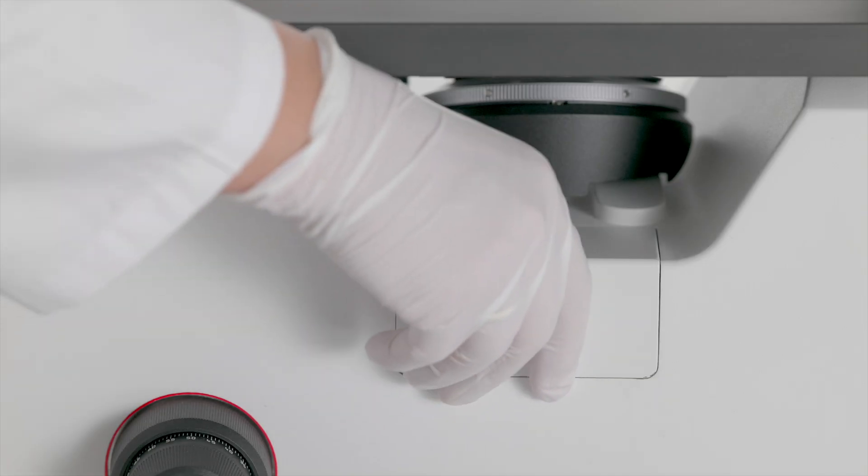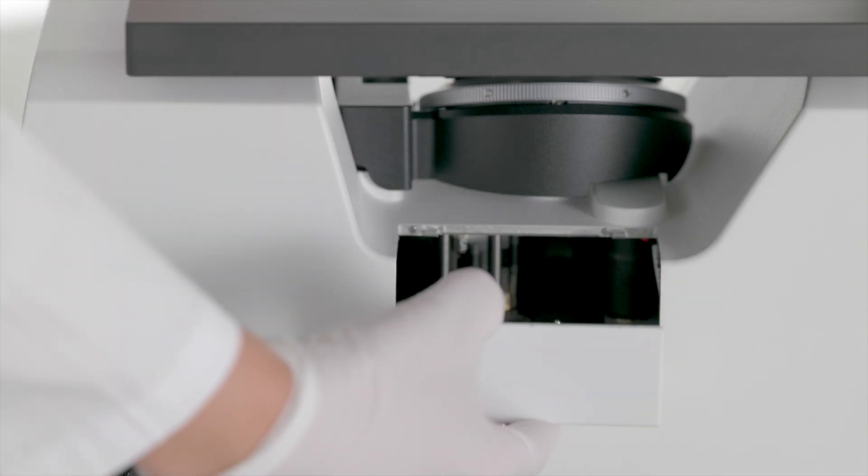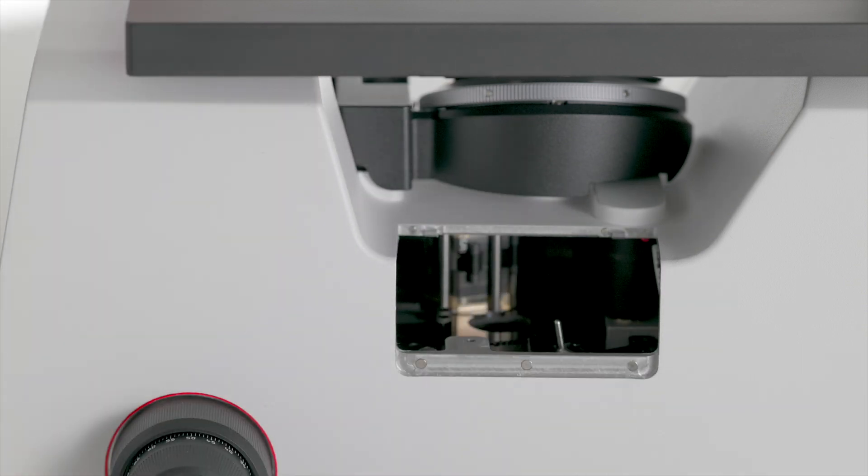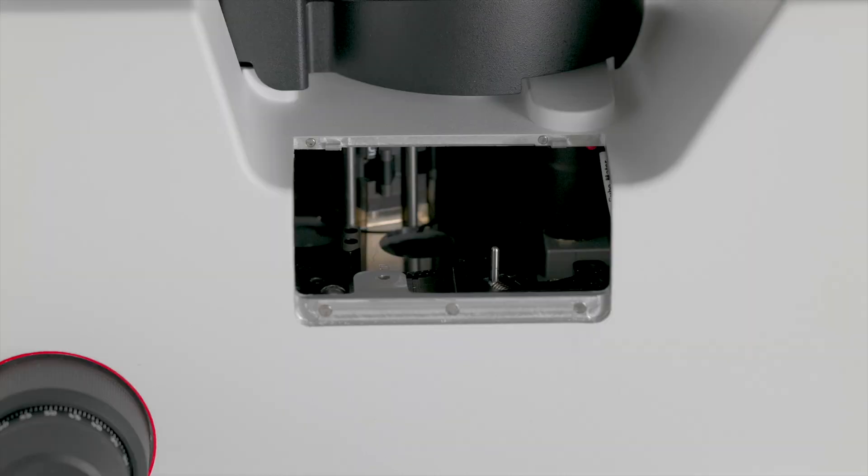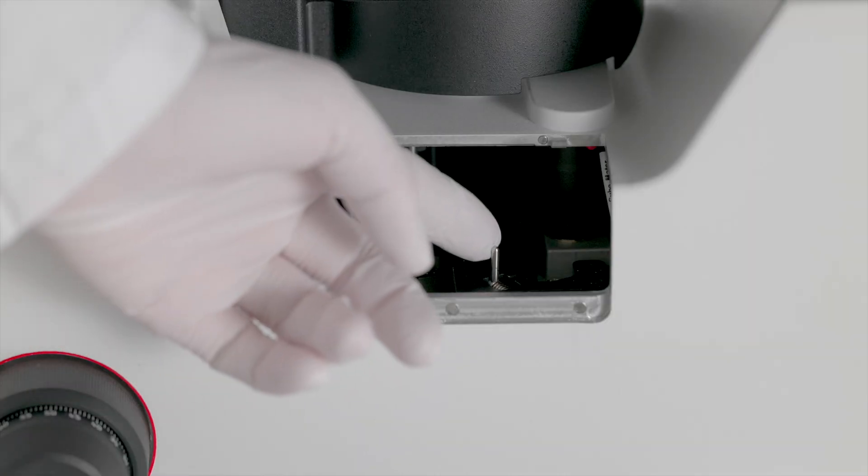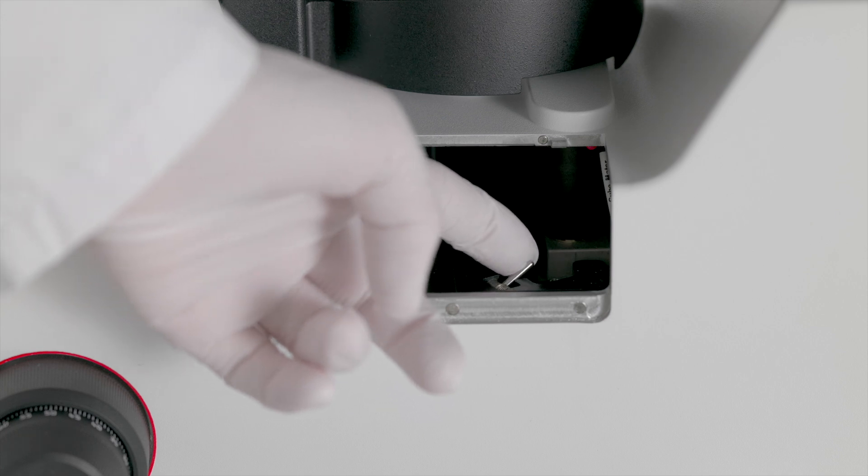To install the filter cubes, first open the magnetic door of the filter cube chamber, which is located on the right-hand side of Mateo FL. Now pull the locking pin through the gap to securely lock the filter cube turret.